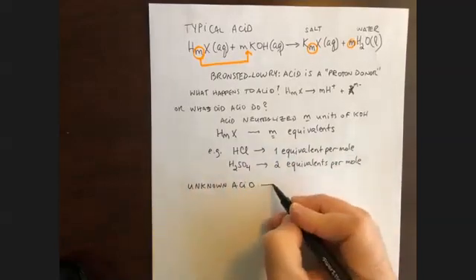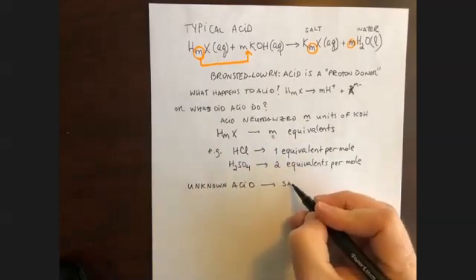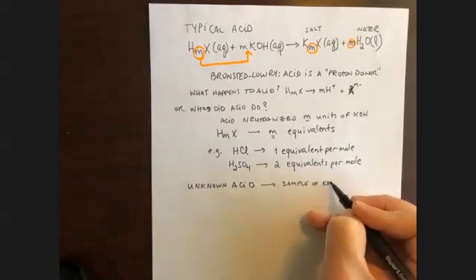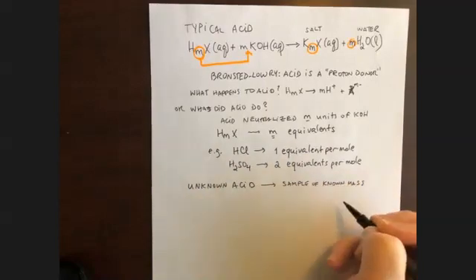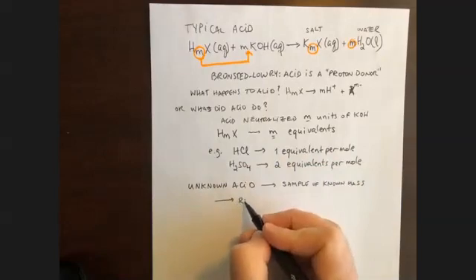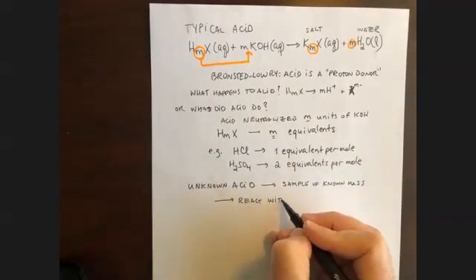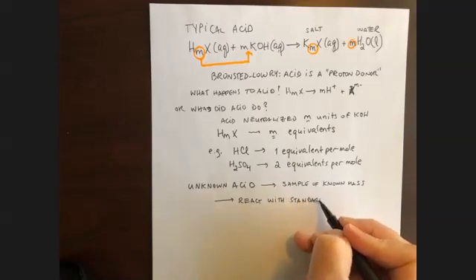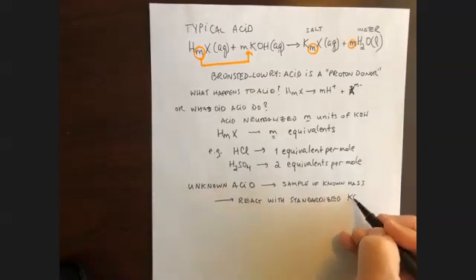But what I can do is measure a sample of known mass, right? And what I can do now is react it with standardized KOH.